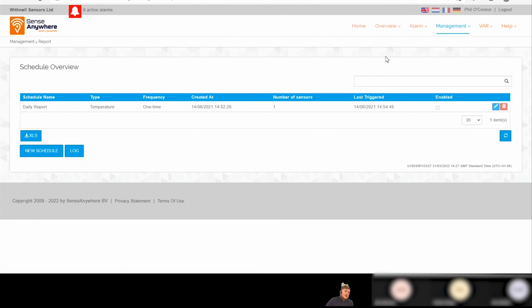Because we do mapping all the time, it can't just be from the Excel spreadsheet. It does have to come through an official SenseAnywhere mapping report, and you have your company logo at the top right in a watermark sort of thing. But yeah, I've made a note to send it over to you. But you can export to CSV as well, though.